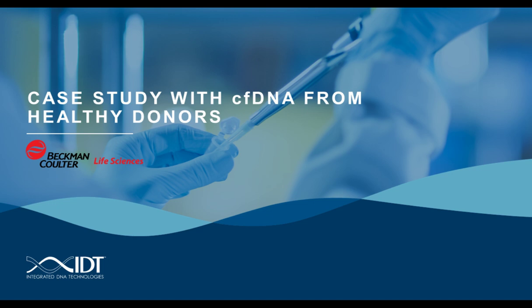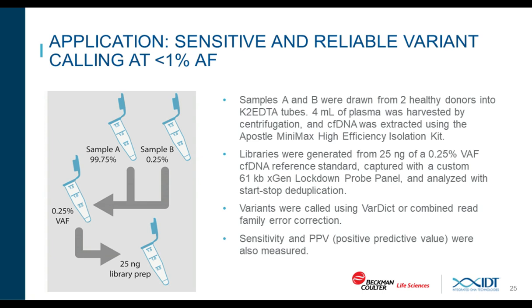Now I have data from a case study with cell-free DNA from healthy donors. Libraries here were generated according to each manufacturer's protocol using 25 nanograms of cell-free DNA.